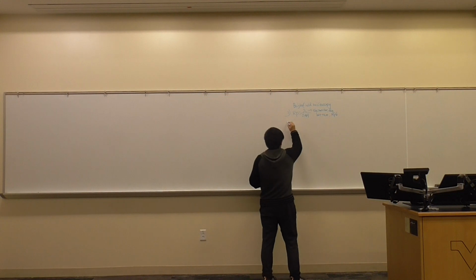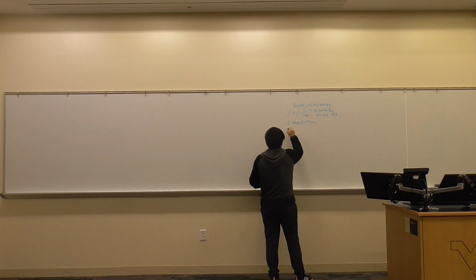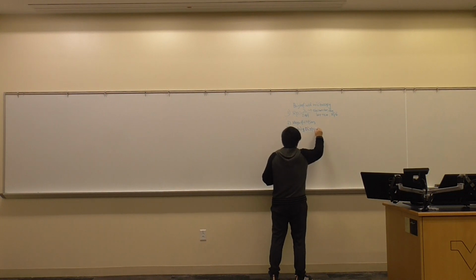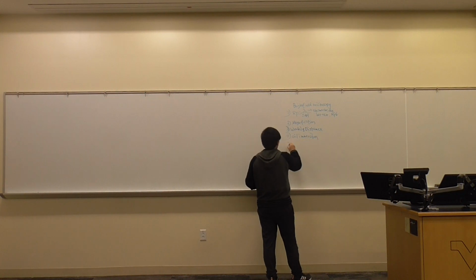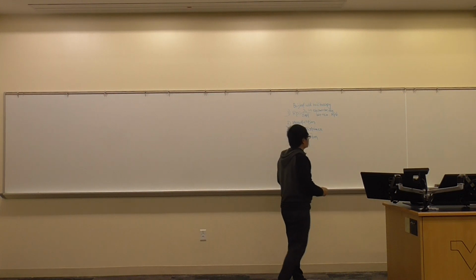And the second one is we talked about the magnification. We talked about the working distance. We talked about the oil immersion. And we also talked about the parfocal. So these are the things we finished talking about for the bright field microscope.